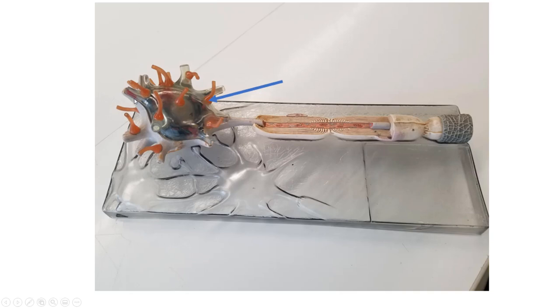These wide projections here—these are the dendrites. Going back to the axon, you can see that in this case it's myelinated. You have this white stuff surrounding it and insulating it—this is the myelin sheath. These look like Schwann cells, so this would be the peripheral nervous system.